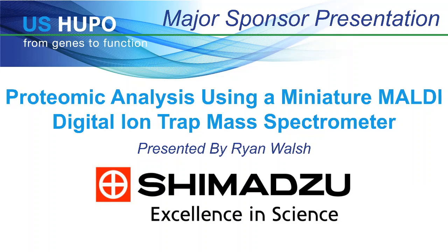However, with the system as it is, the ion source is just currently a MALDI. And so in the future— I was thinking specifically of the activation methods. So, ETD, HCD, all that kind of stuff. Oh, I'm sorry. I misunderstood what you said. So currently, only CID is available with this system. So the other techniques, I don't believe there's plans to have those.